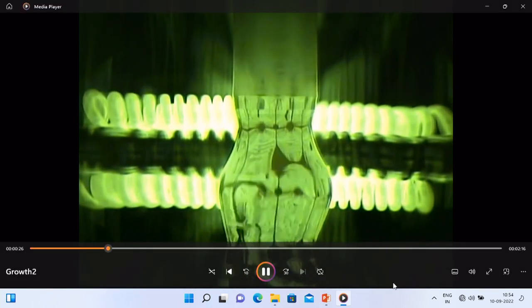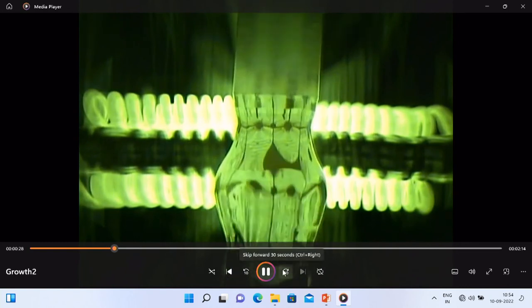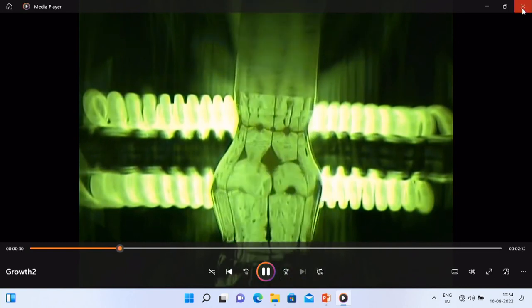This is the one I spoke about: a few grams of seed carrying a lot of weight by proper necking. This is optimized growth, right? The top is seed, the bottom is grown crystal. But if you do not have that optimized, you can't carry the crystal below. Okay, next one, is it necking?